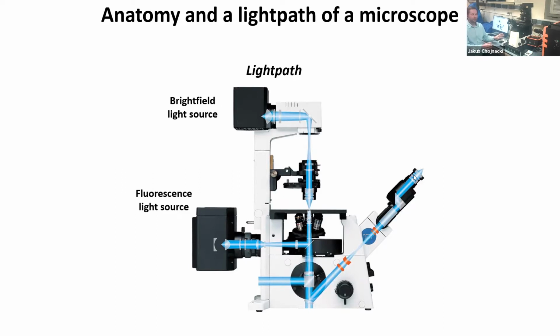However, many of the microscopes you will see, even the commercial ones, still retain this part, because as I was saying, seeing is believing, and being able to see the samples allows us to quickly process that information without relying on computers. Computers can process information and are also very powerful, but sometimes they are limited to the tasks that have been specified to them, whereas we are a bit more versatile.